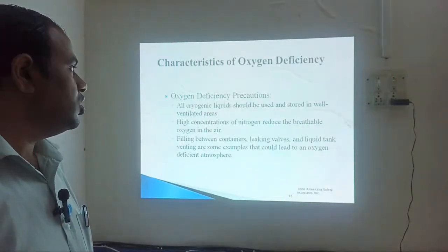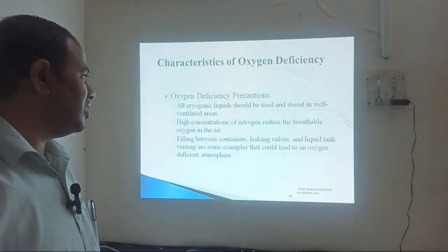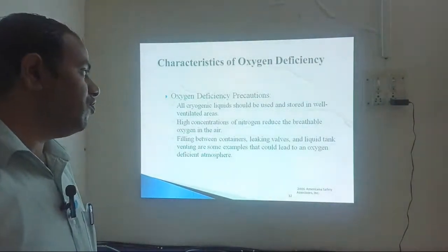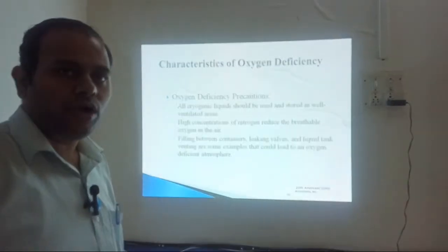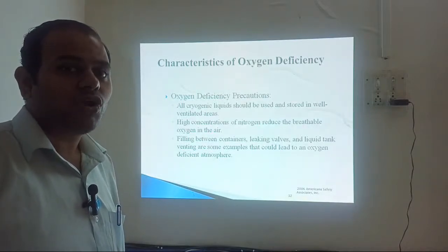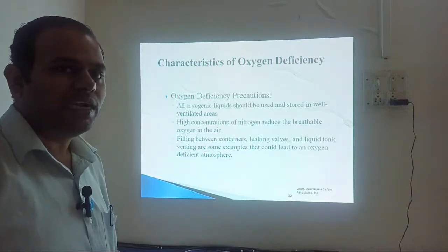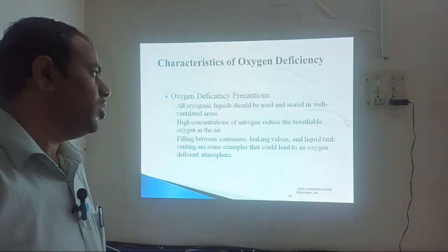All cryogenic containers should be stored in a well ventilated area where ventilation is proper. You should store them in that area. Okay, so a high concentration of nitrogen reduces the breathable oxygen in the air, so you have to be very, very careful. And filling between containers, leaking valves, and liquid tank venting should also be avoided. Okay, see, the generation nowadays finds it funny, but it is not at all funny. Different people use liquid nitrogen for dipping biscuits and all. That's a trend nowadays, but it is not good. If you are accidentally exposed to liquid nitrogen, it can cause severe frostbite. You should remember this.